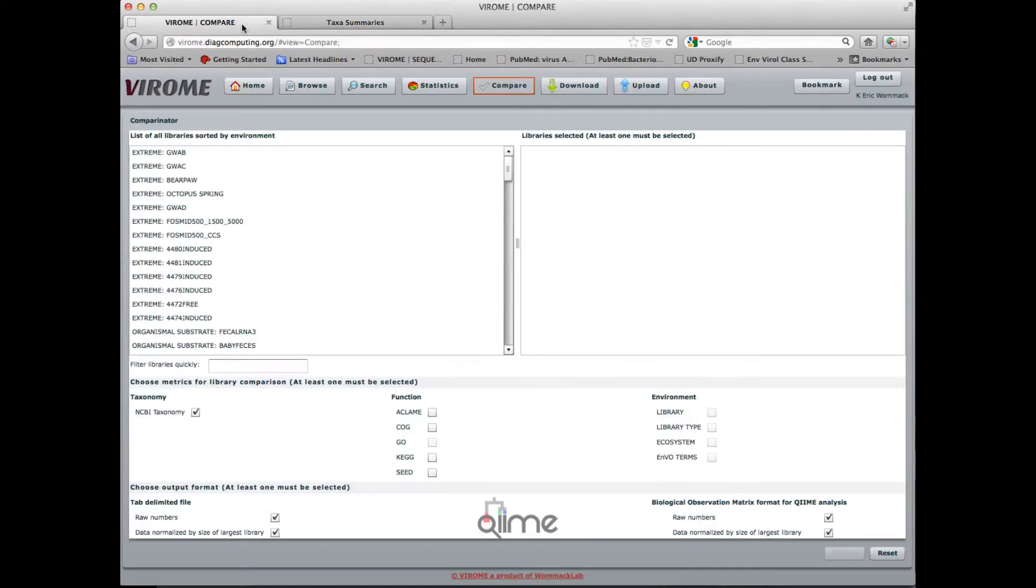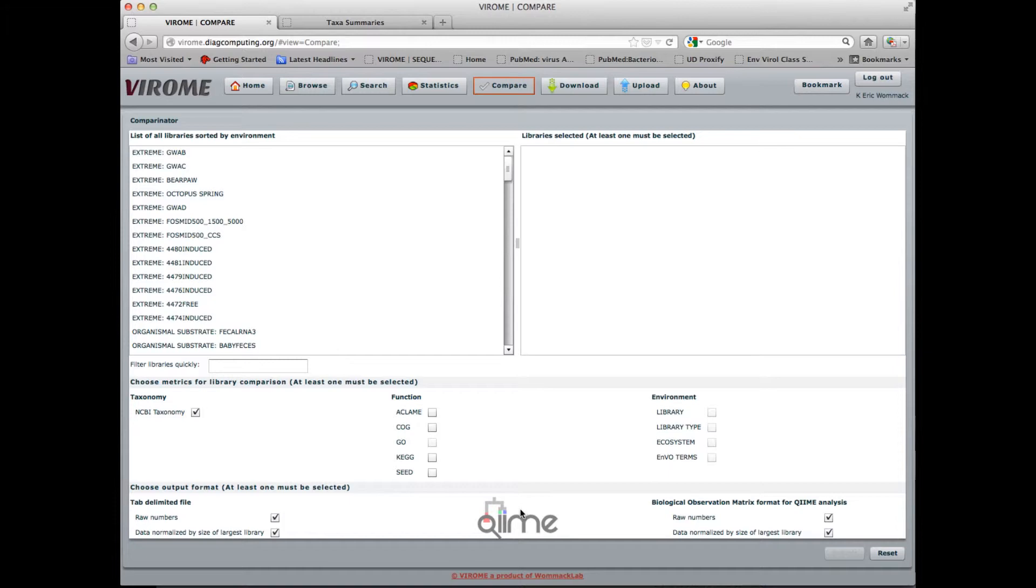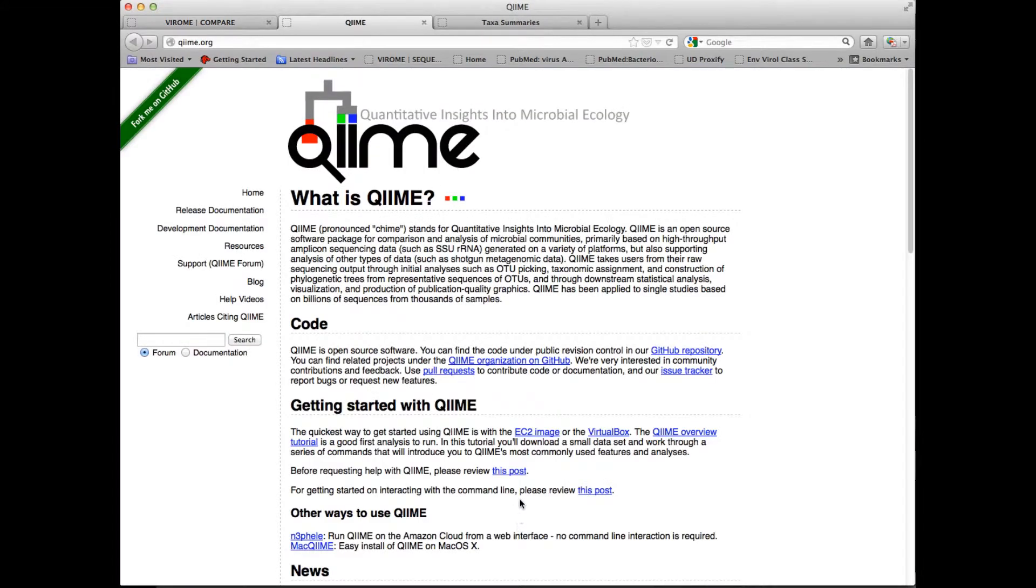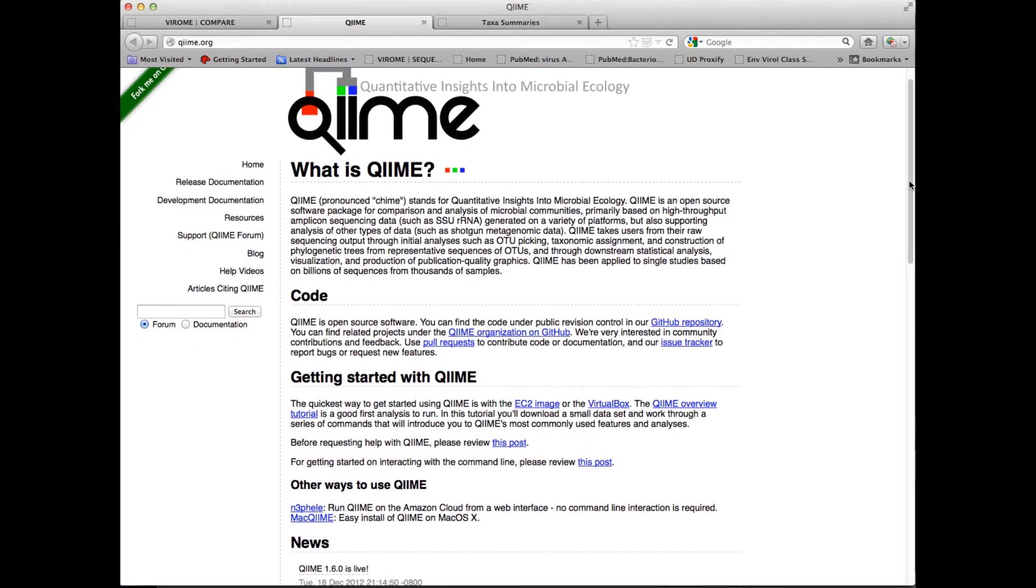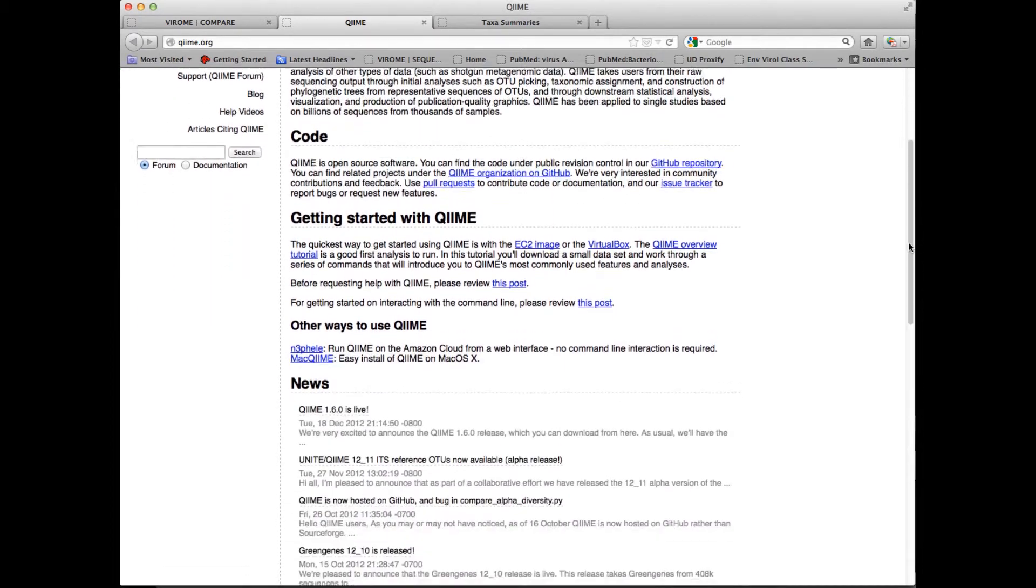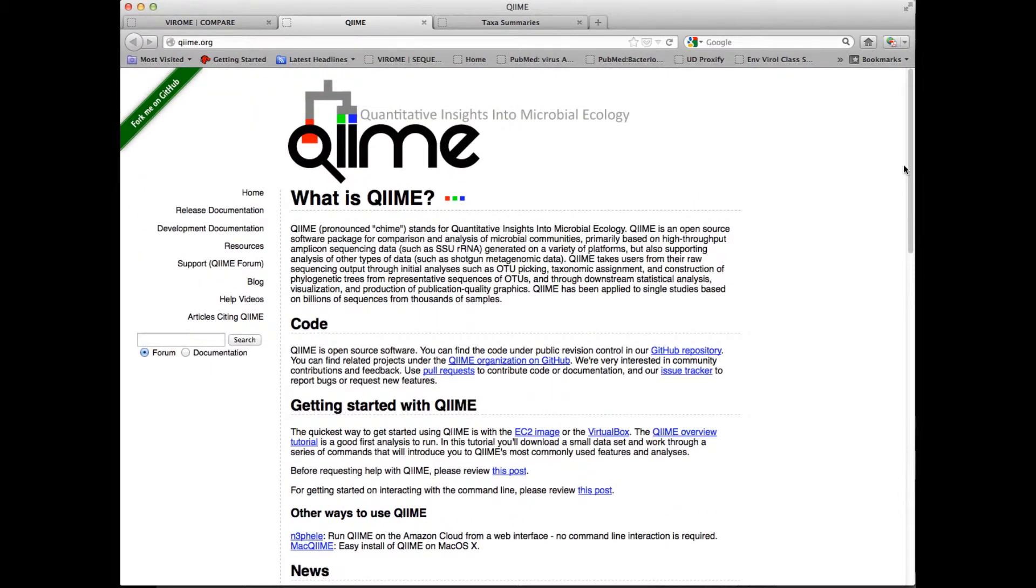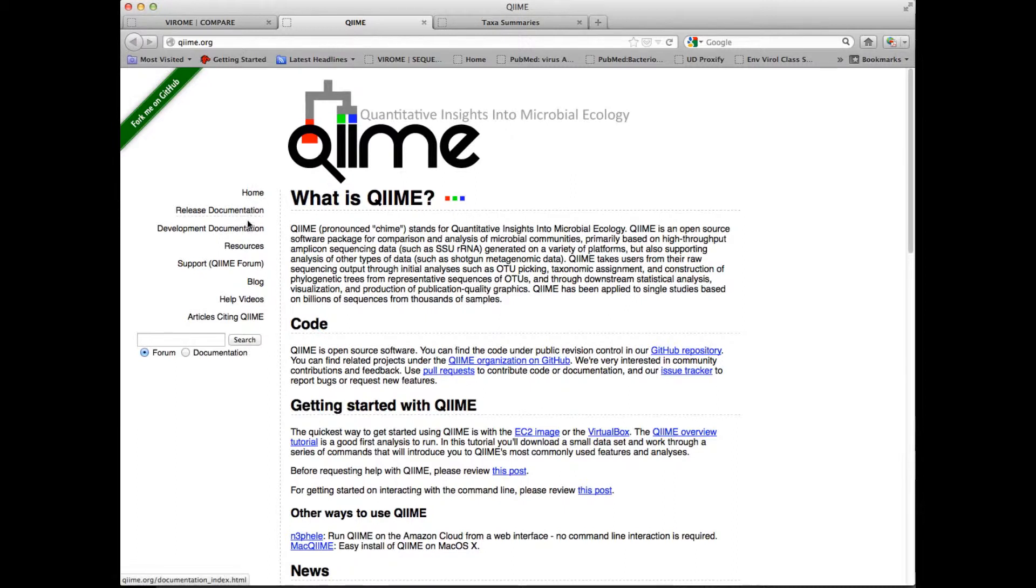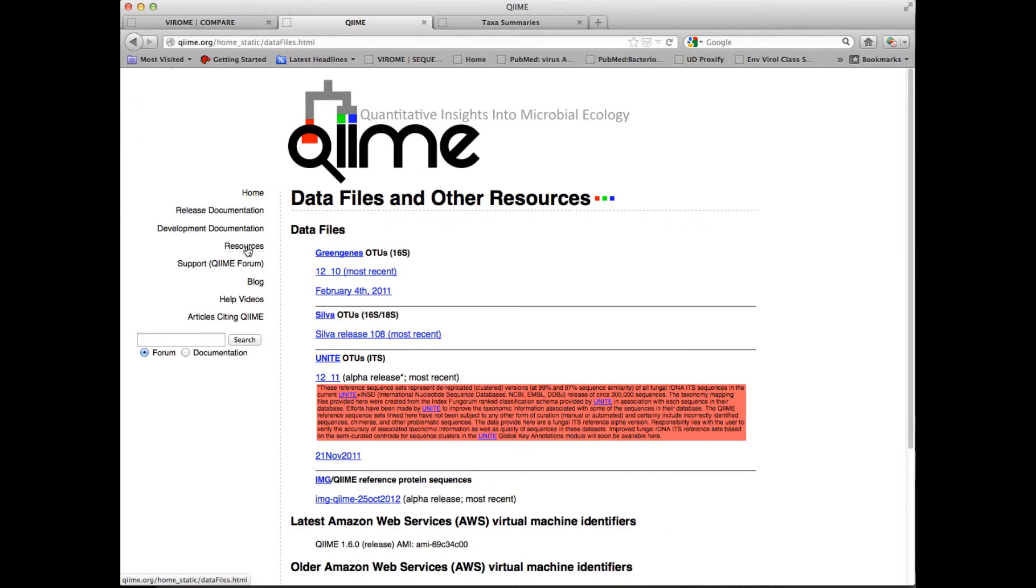So moving back to VIROME, there are many functions available in QIIME. There's a direct link here to the front page of QIIME, where there are excellent resources for learning how to use this fantastic package. I would suggest you go through the QIIME tutorial to learn more about the QIIME package.